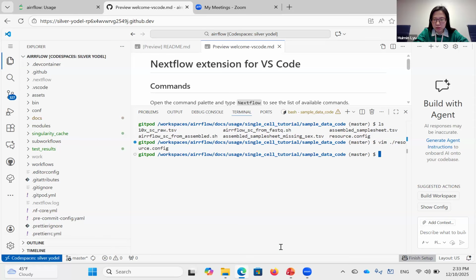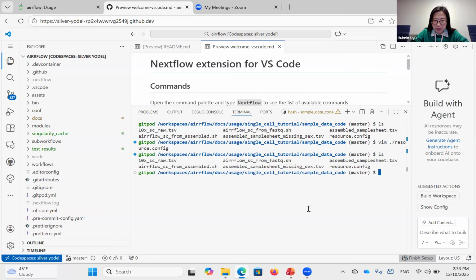Yeah, I use the command to change it, but if you are not familiar with it, you can just go to the files, open it, change it and save it. Okay, and also there's one thing that I need to have a look at, because we will also provide the bash file that you need to just run the pipeline with it. So here, let's double check.